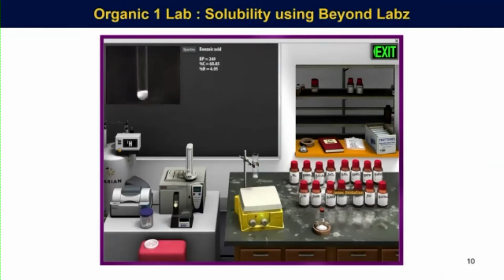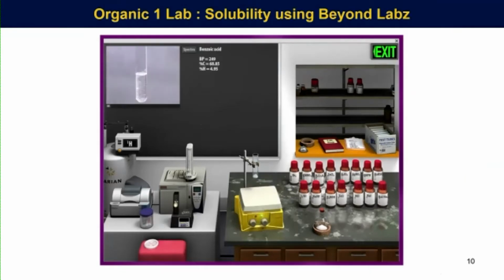We took benzoic acid as a simple example, and thinking again about organic moving into the separatory funnel work and thinking about extractions. If they use aqueous HCl, it should not dissolve, and it doesn't. So that was nice, and they can see that. But then if they do the last experiment here, which was, I believe, using sodium hydroxide, they're going to get chemistry.